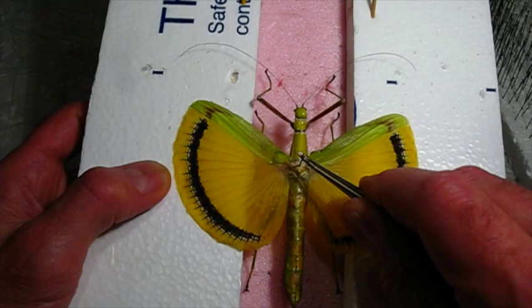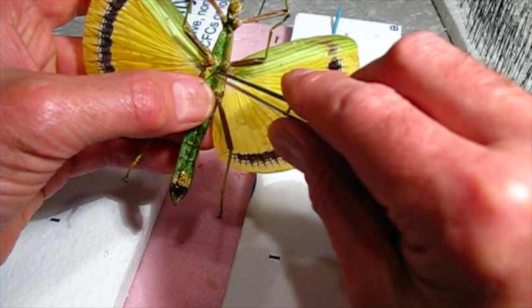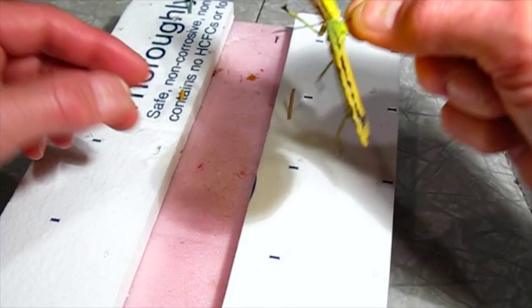Let's see how it looks. Now this one, since all the gut was removed, there's nothing really to hold the pin. And you can see it slides through very easily.